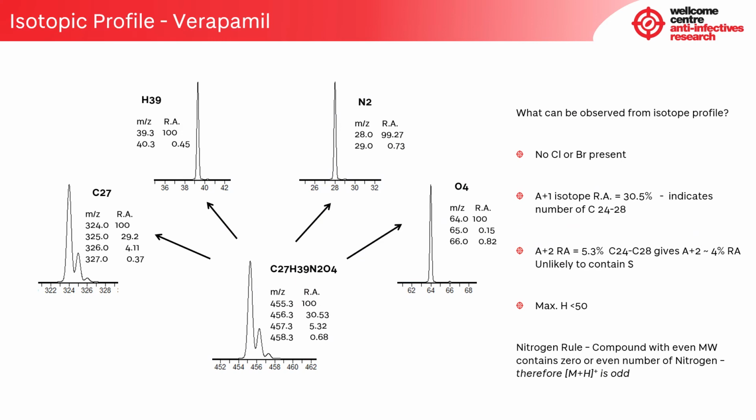It's not often that cookery can be mixed with mass spectrometry, but in a similar manner to the way in which a contestant on MasterChef might deconstruct a dish, such as a creme brulee, so we can deconstruct the isotopic profile of verapamil and look at the effect of the individual elements on the overall isotope pattern.